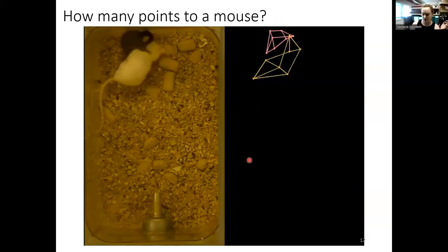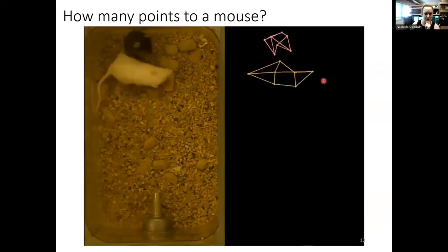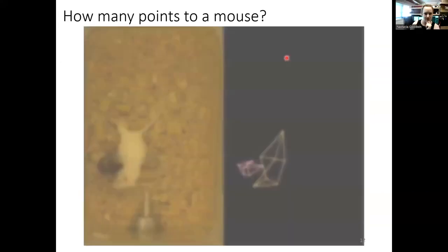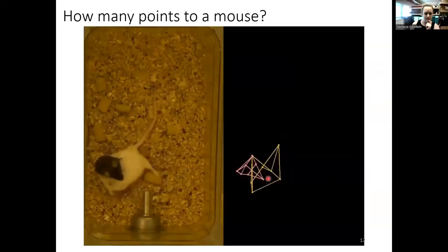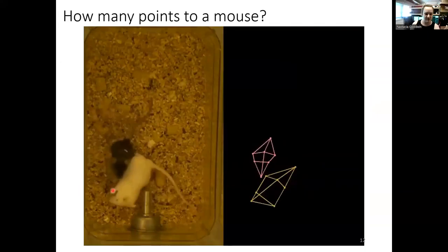If we watch this video, I can gain a lot of information about attack here and the way that my animals are moving around each other. But if you were looking for reaching behavior, obviously the paws aren't annotated, and so you wouldn't be able to see that. So I think it can be really helpful to draw out these dots and look at the minimum skeleton that you would need to identify your behavior of interest when doing this.